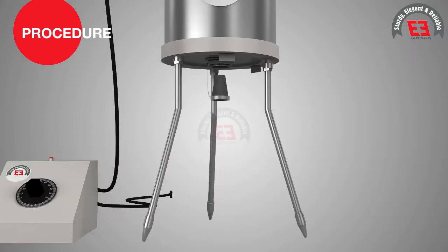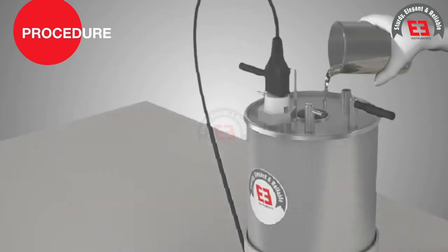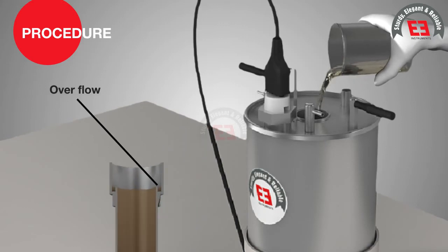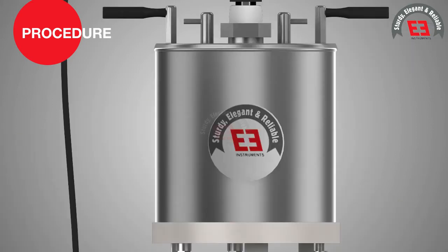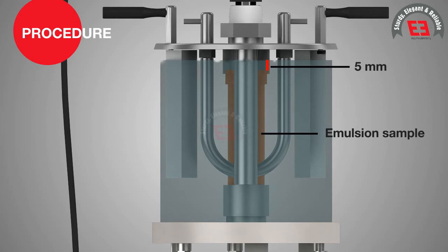Insert the cork to the bottom of the oil tube, taking care that the cork fits tightly enough to prevent the escape of air, as confirmed by the absence of oil on the cork after it is withdrawn. Pour the emulsion into the oil tube up to overflow into the gallery. The tube with the emulsion sample is fixed to the support in the bath such that the top of the overflow rim is 5 mm below the surface of the water in the bath.